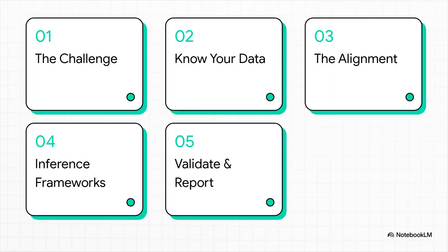Okay, so here's our game plan. We're going to start by laying out the tree building challenge itself. Then we'll walk through the essential steps. First, getting to know your data. Next step, the alignment. Then we'll talk about the inference frameworks, the engines that do the work. And finally, we'll cover how to validate and report your findings.